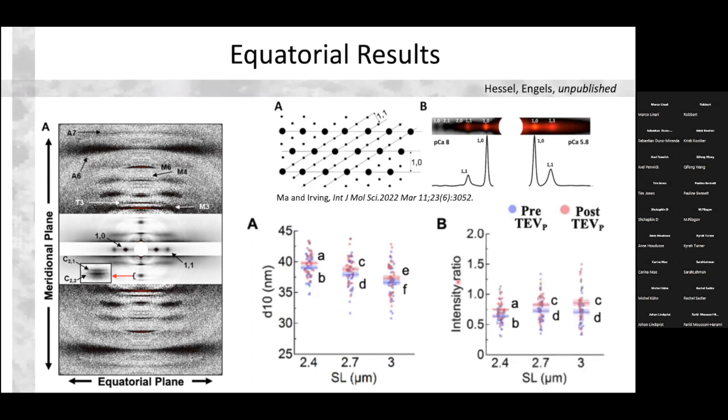So here we took a look at intensity ratio for what's commonly considered as distribution of the myosin heads, either toward or away from actin here. And what we see is, again, an increase in intensity ratios consistent with the idea that myosin heads might be moving out towards actin. And this also was reported for the knockout mice as well by Brett Colson, I believe.